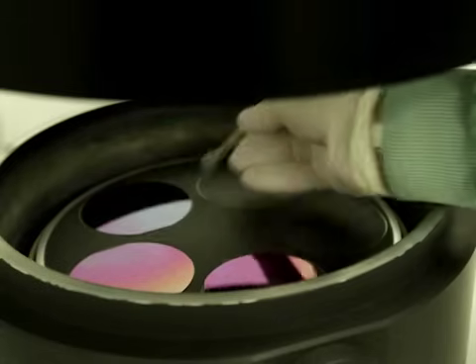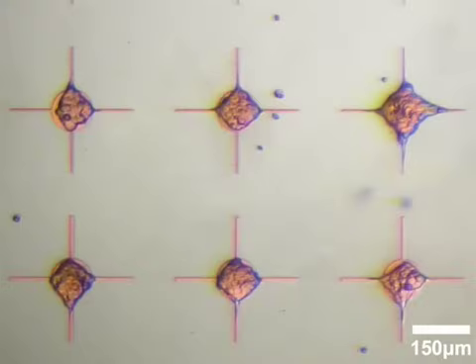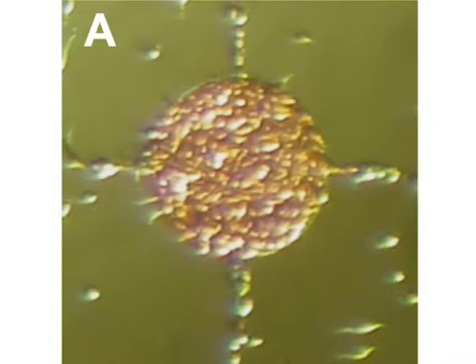The remaining photoresist is then removed to leave only the patterned polymer. The patterned polymer can be used to induce controlled cell growth on or around the polymer islands.